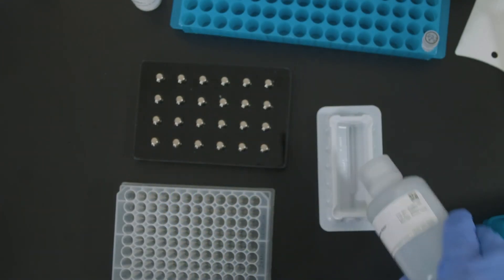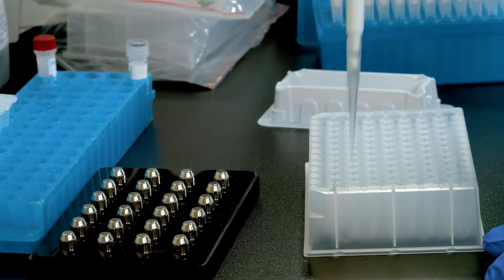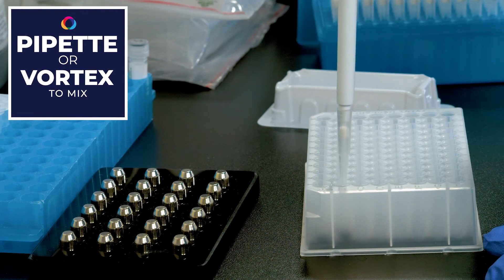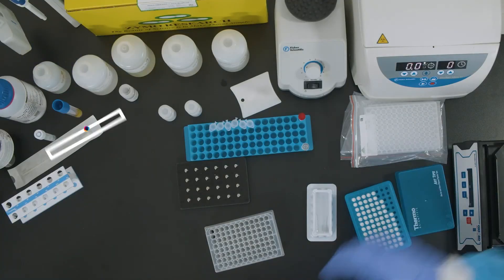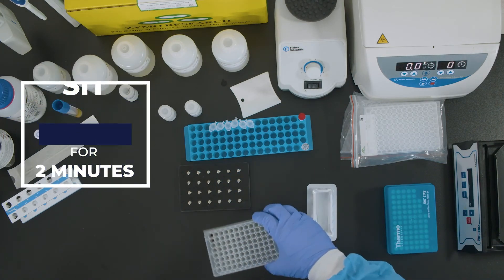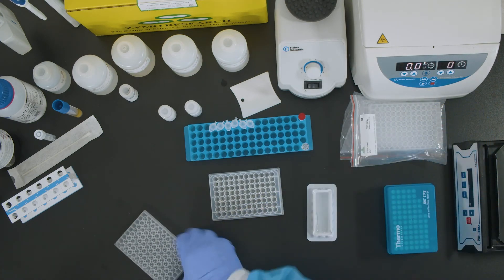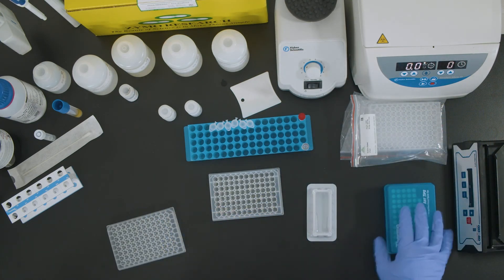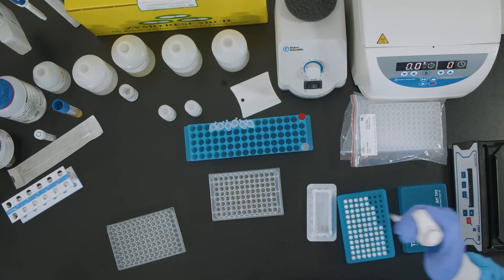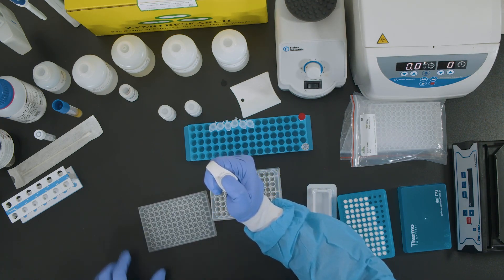Elute the nucleic acid from the beads by adding 50 microliters of DNase/RNase-free water. Pipette up and down to mix in plates or vortex to mix in tubes. Allow the plate to sit at room temperature for 2 minutes. After 2 minutes, pellet the magnetic beads and transfer the eluate to the elution plate for storage.